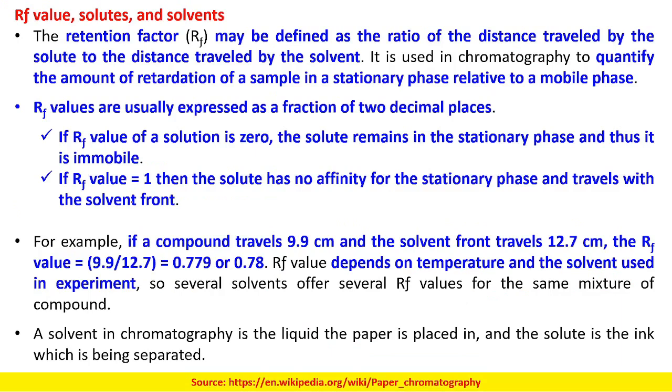Okay, now we have this retention factor. What is this retention factor? The retention factor is defined as the ratio of the distance traveled by the solute to the distance traveled by the solvent. Okay, suppose this is the solvent front and you have this spot over here.